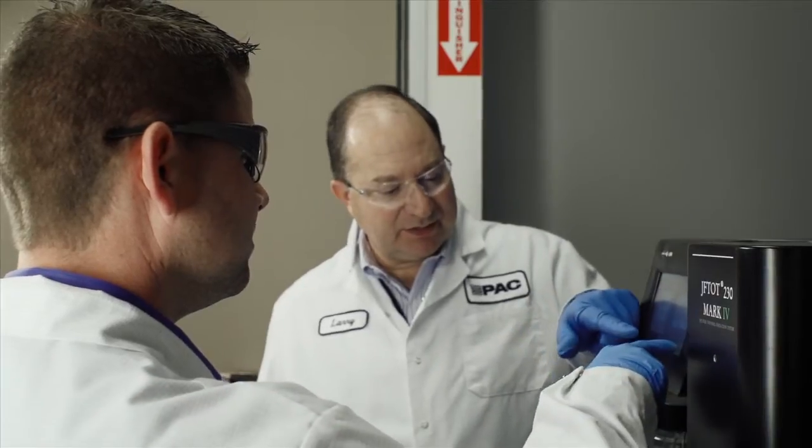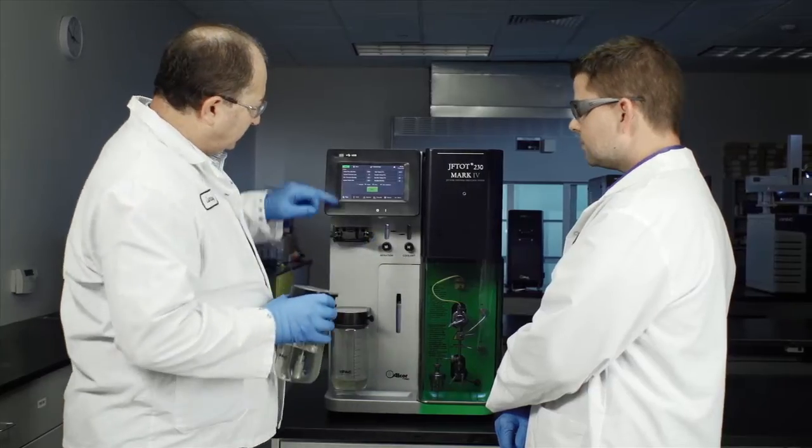The Jephtot 4 is so easy that you'll need almost no training, even for technicians with limited analytical and instrumentation experience.